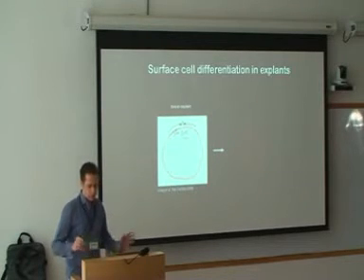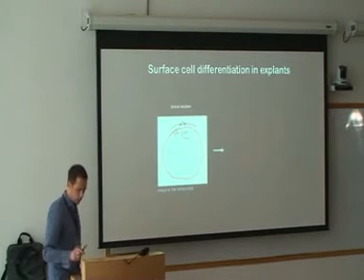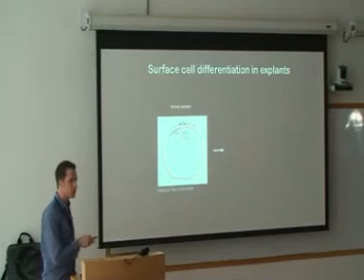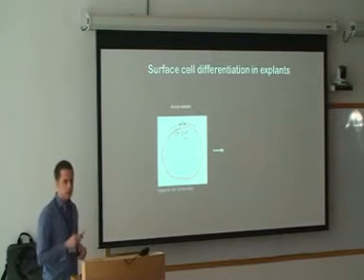Okay, so we thought we are one step further now to understand how these progenitor cells are segregating, till we discovered one feature of the system which was a bit problematic. When you look at a cluster of progenitor cells, and this is a relatively small cluster, but you can have hundreds of cells, you put them into a culture dish, you wait till they round up, and you watch them, and then you do your surface tension measurements.